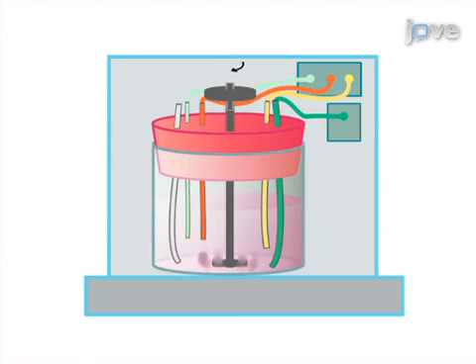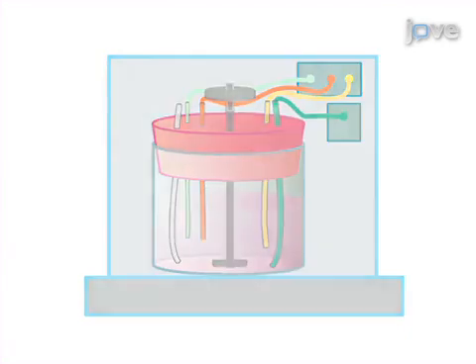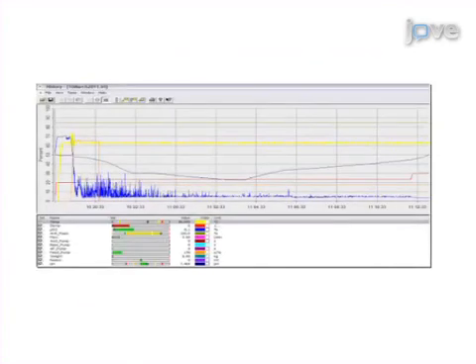After manual calibration of the oxygen probe, the final step is to inoculate the bioreactor with the bacterial culture and monitor the conditions of the bioreactor by the computer software.